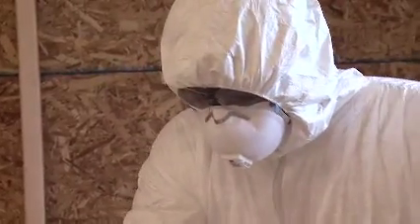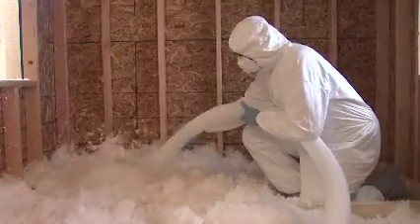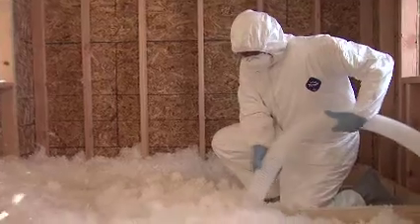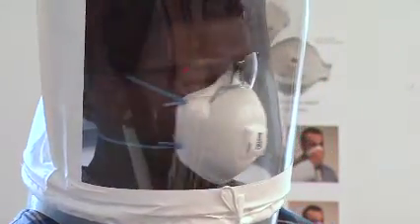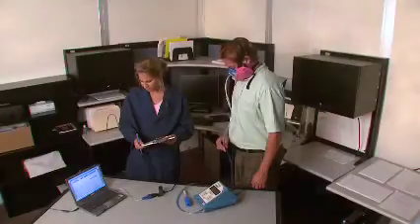Many workers need to wear prescription glasses or personal protective equipment, such as safety goggles or earmuffs, while performing a job. If you fall into this category, then you must wear these items during the fit test to be sure they don't interfere with the respirator's fit.